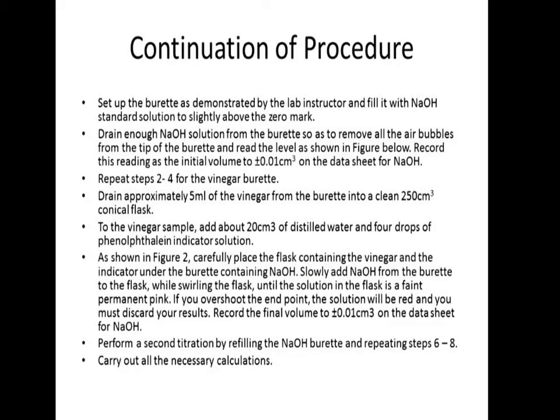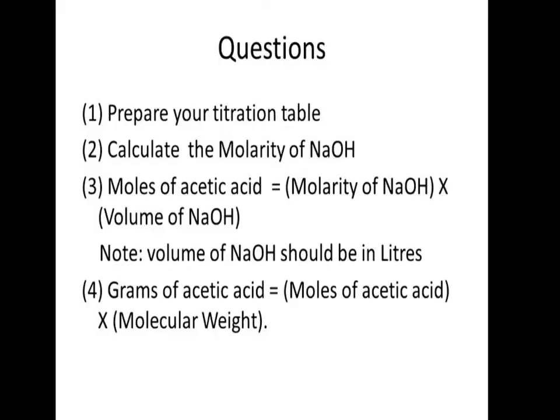What are the likely questions your lecturer might expect you to have an idea about? Number 1, you may be requested to prepare your titration table.